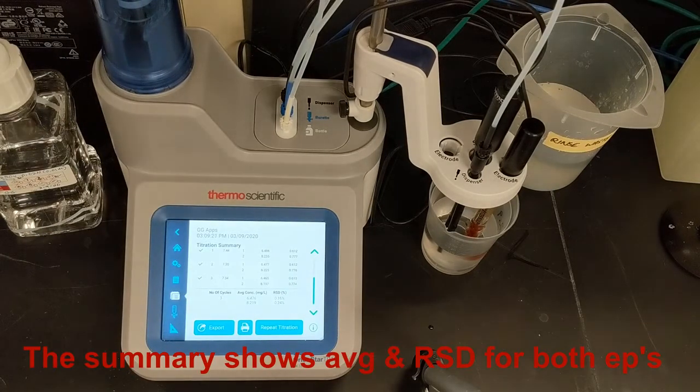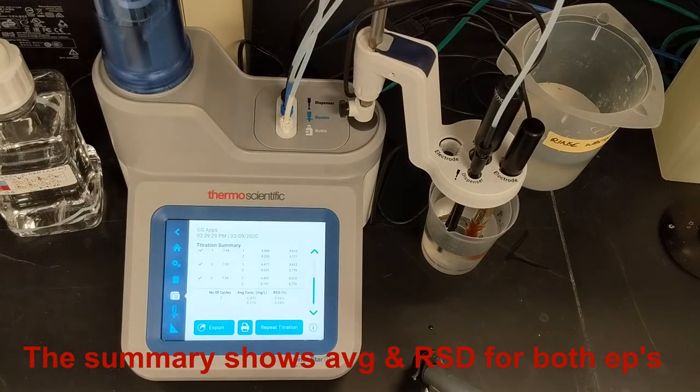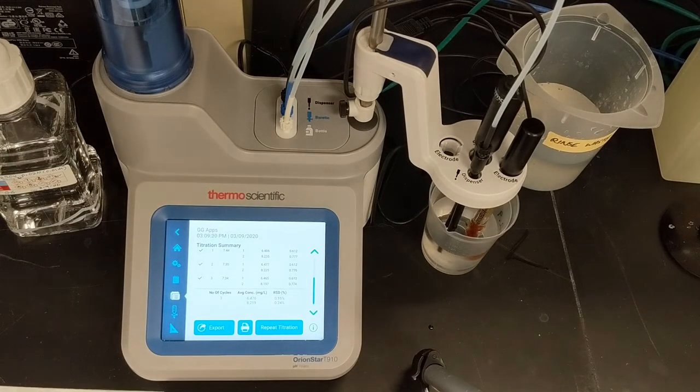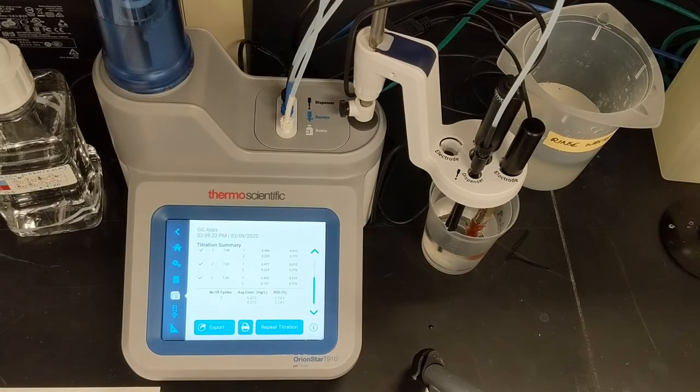The summary shows the average value and the percent RSD for both endpoints of the three cycles. Note that the percent RSDs are quite good, 0.16% for the first endpoint at pH 4.5 and 0.24% for the second endpoint at pH 4.2.